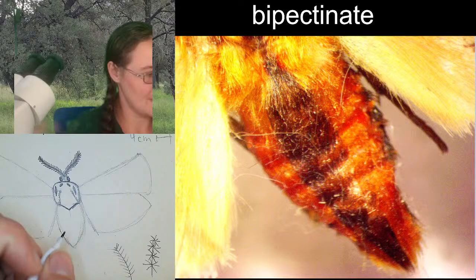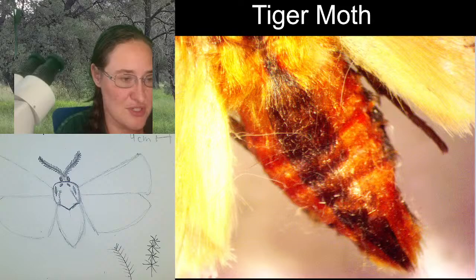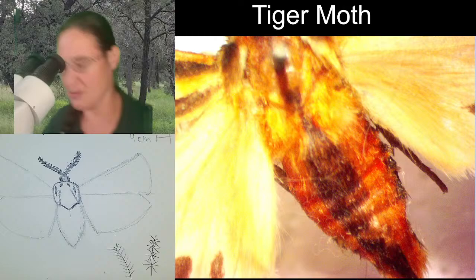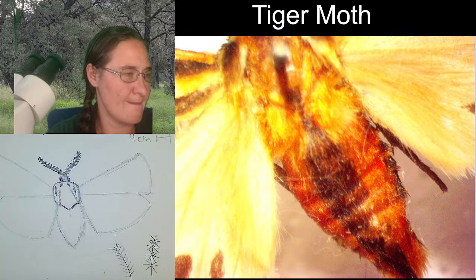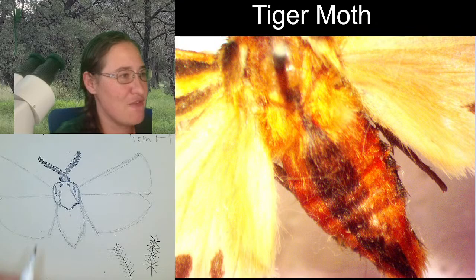Alrighty. We're looking at the abdomen. If we try really hard to count these abdominal segments, we might be able to do it, although up here at the top, where that triangular piece is, it might be a little difficult because of the hair. Let's see. 1, 2, 3, 4, 5, 6, with a possible 7. That's what I'm looking at. 1, 2, 3, 4, 5, 6, possibly 7, depending on how fluffy the abdomen is.